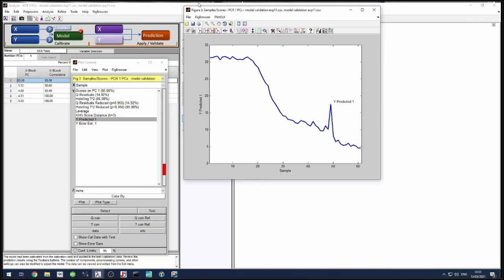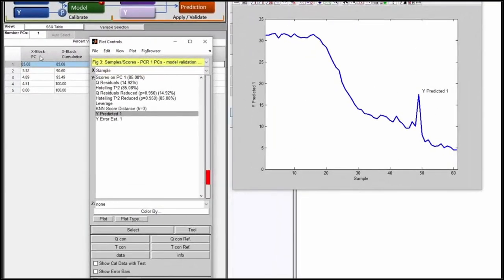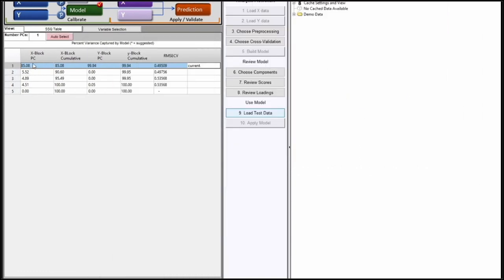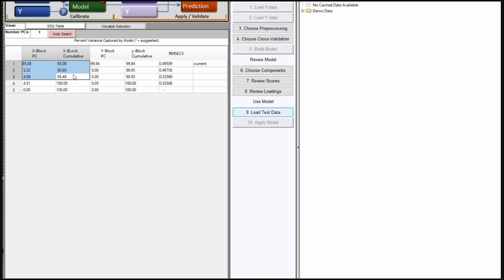So one of the other things that I wanted to show you here was the contributions from the different principal components. What the principal components look like are different combinations. They're linear combinations of the different peaks and the different intensities. But the different components explain different amounts of the variance in the data set. So the first component explains 85% of the variance in the data. Second component, a further 5%. Third component, a further 5%. So the combination of just the first three components results in 95% of the variance in the data being explained by the model.